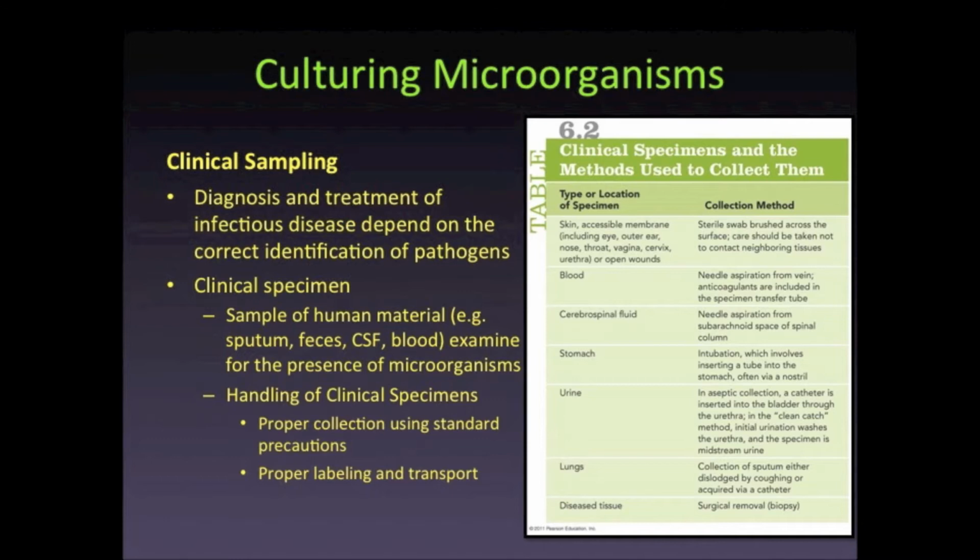The isolation and identification of pathogens is an important process in diagnosing and treating patients. Proper specimen collection is a crucial first step on which the isolation and accurate identification of pathogens are dependent. Healthcare professionals are responsible for the proper collection and transport of clinical samples.